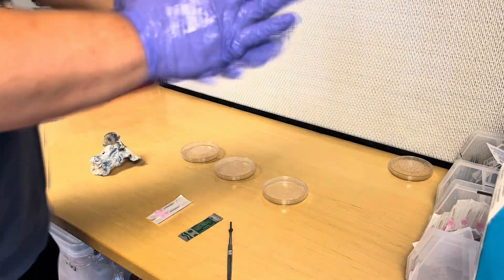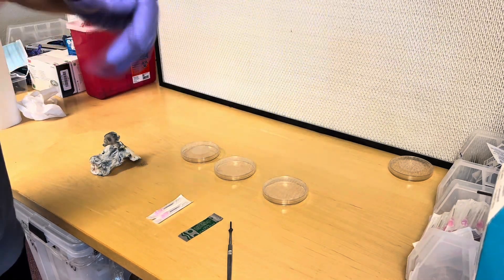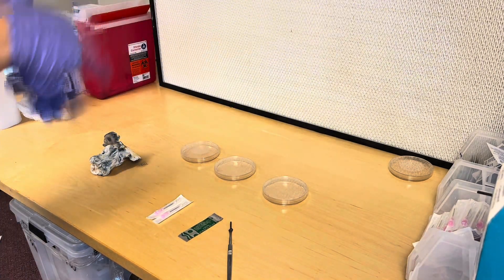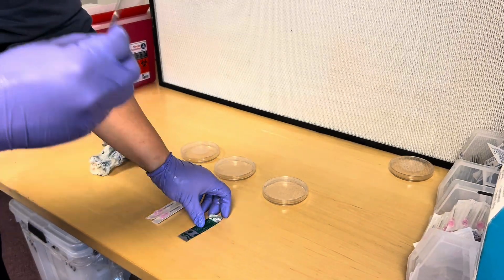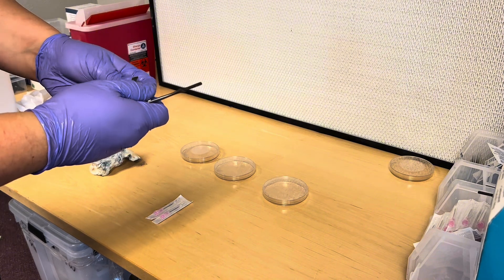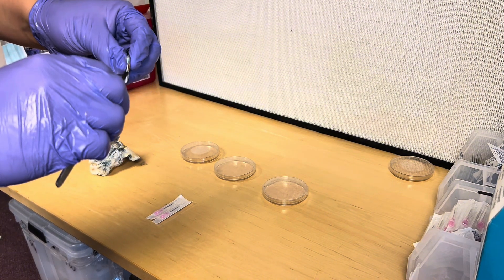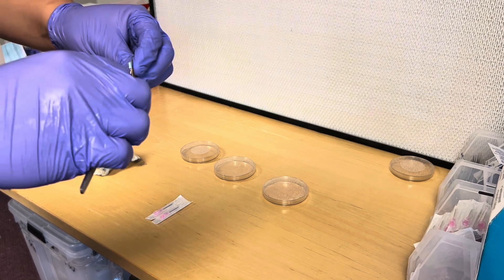I always like to be super safe — I spray isopropyl alcohol on my hands and arms two or three times, maybe even four or five times during the whole process, because it's better to be safe than sorry. I was also known as the contamination king for a while, so you don't have to do it this many times, but I just do it more than you have to. Go ahead and put your scalpel blade on.